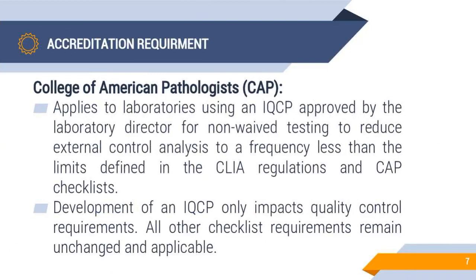These 5 requirements apply to laboratories using IQCP approved by the lab director, of course, for non-waived testing. Waived, by the way, is not applicable for waived testing. It applies when you reduce external control analysis to a frequency less than the limit defined in the CLIA regulation and CAP checklist.